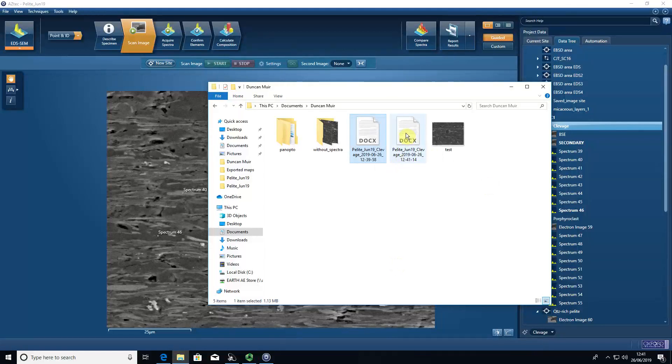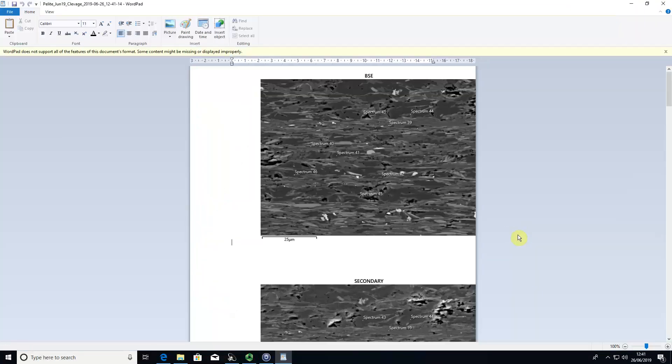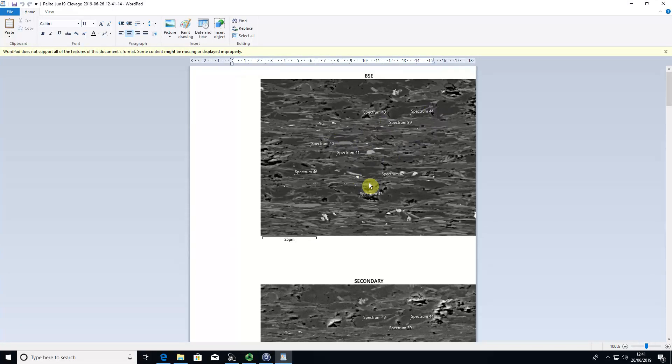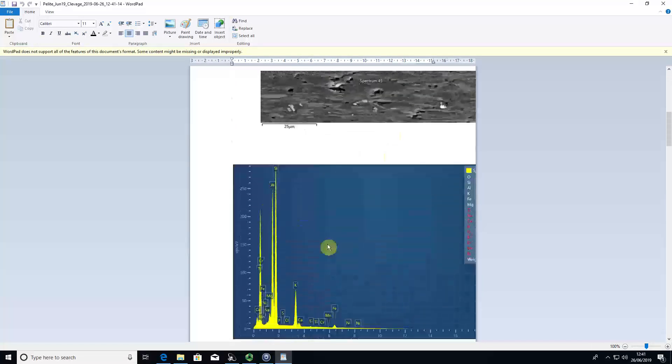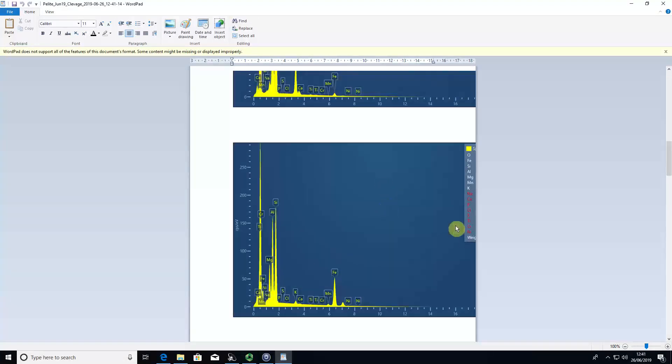It has a time stamp on it, so it hasn't overwritten the earlier one. If you open that, you can now see that the backscatter image has the spectrum locations, and then we can link up where the spectra chemical data is from.